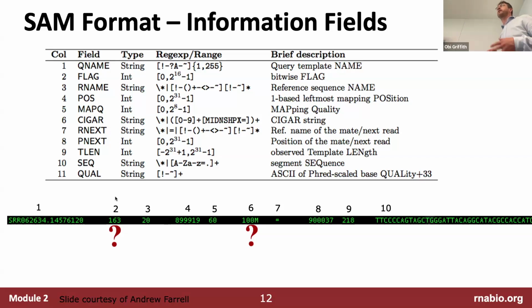Most people have at some point taken a sequence and blasted it, and you get back that nice ASCII picture of how your read aligns to the reference sequence, with little lines that tell you these bases match, and a gap or an X or a star, I forget, where there are mismatches. It really shows you how this thing aligned against that thing. It's either a perfect match, or a match and a gap and a match, or a match and a mismatch and a match.